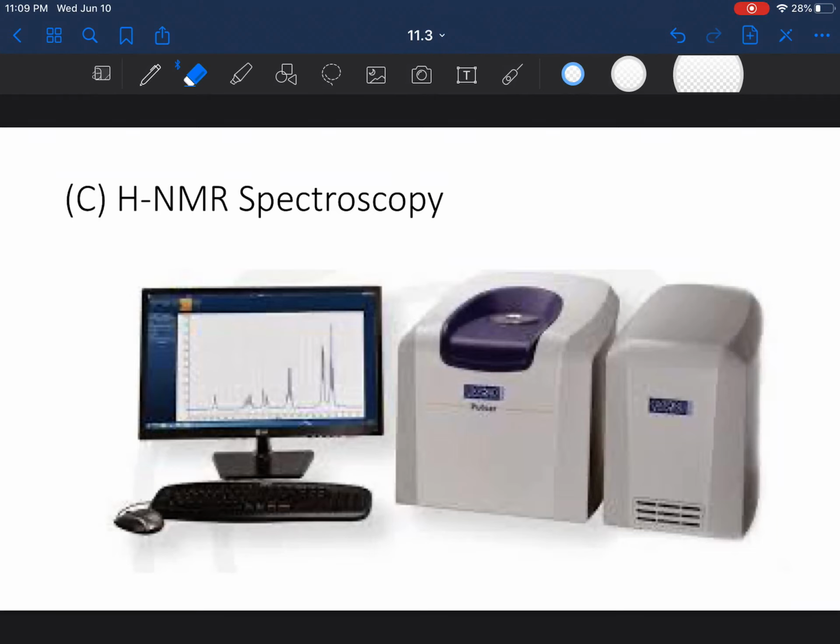Hey everyone. So on Friday we talked about two spectroscopic analyses. The first one was IHD. IHD kind of tells you, by calculating, of course, it gives you a number, and this number tells you if there is a double bond in this unknown, does it have a triple bond, does it have a ring, is it a benzene, stuff like that. So it's a very good way to check to see if you're right.